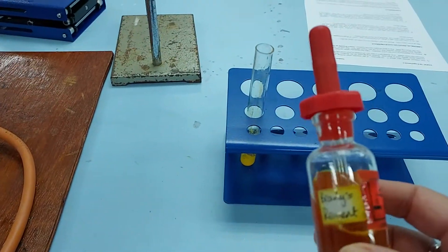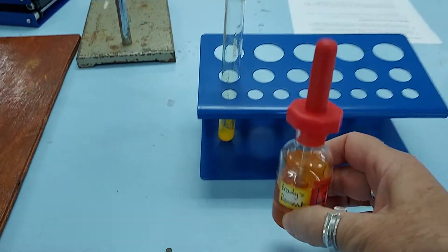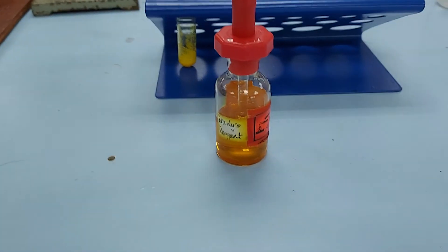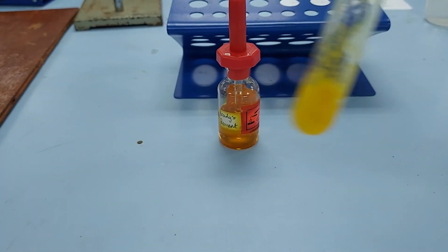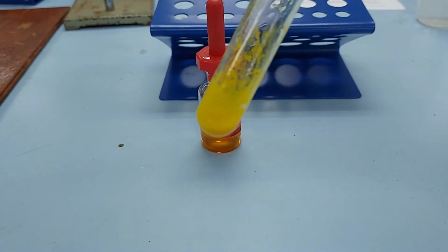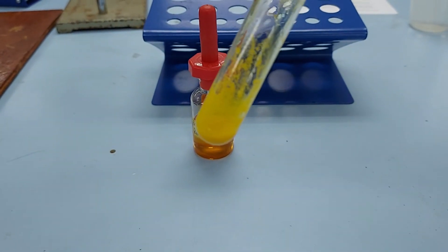We tested our product with Brady's reagent, an orange solution here. You can see we've got a positive test with a lovely precipitate formed, which indicates that we have made an aldehyde.